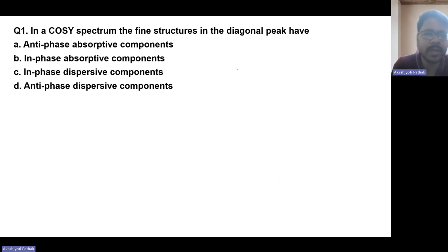We get four terms after the FID is collected and we Fourier transform it. When we solve the trace of this rho 5, we get four terms. All these four terms will give us four different peaks in the diagonal part of the 2D spectra. And these four peaks are all sine components, so we will have in-phase dispersive components. Okay.